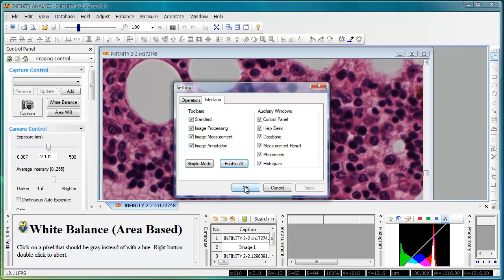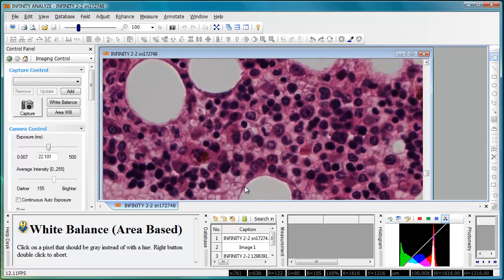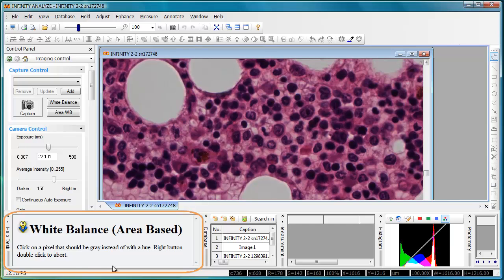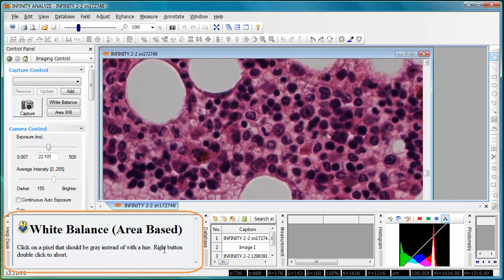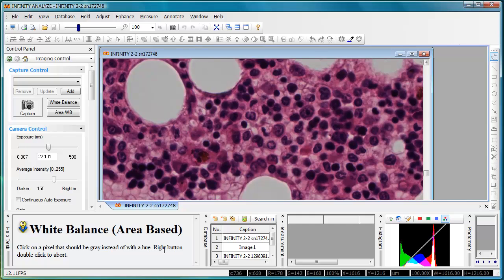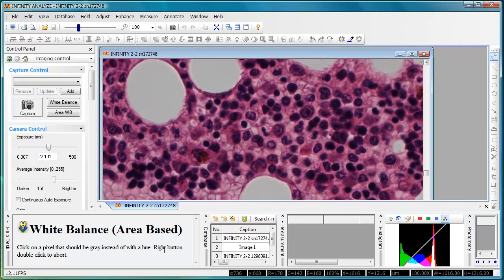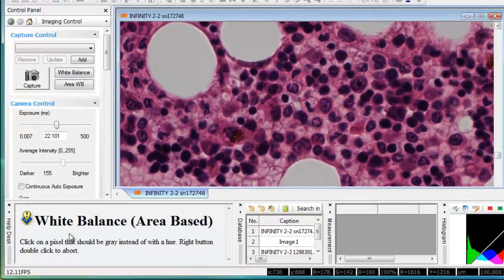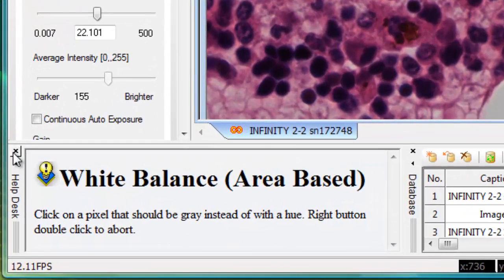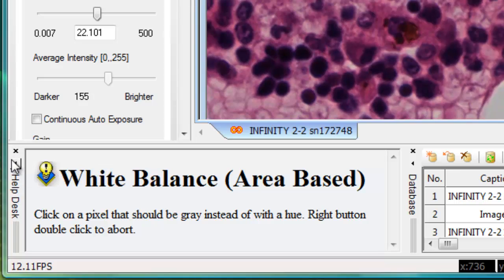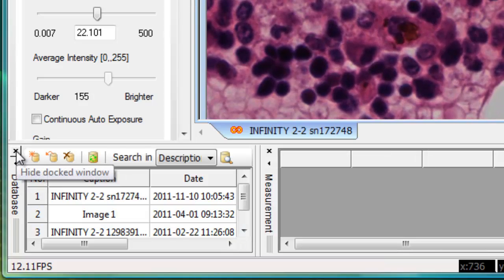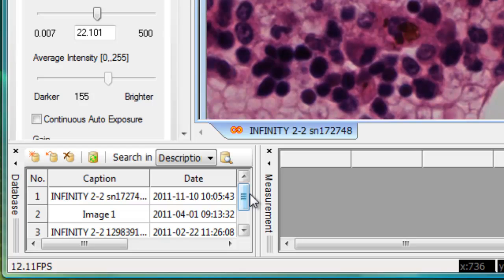We'll click OK to hide this dialog. Any item on the screen can be dragged or resized. For example, initially you may want to have the help desk window visible at all times, as it provides context sensitive help and instructions on the different control functions that you might invoke. But once you're familiar with the application, you may elect to either hide this or to remove it from your display to save screen real estate.